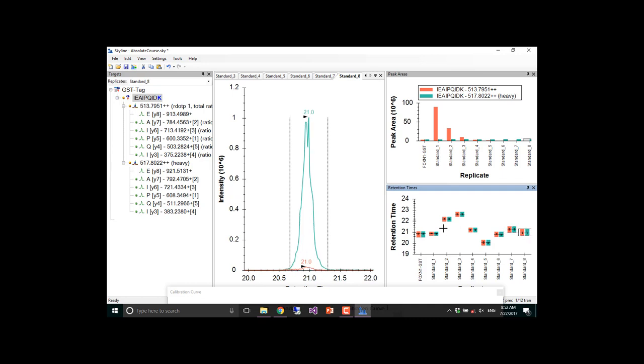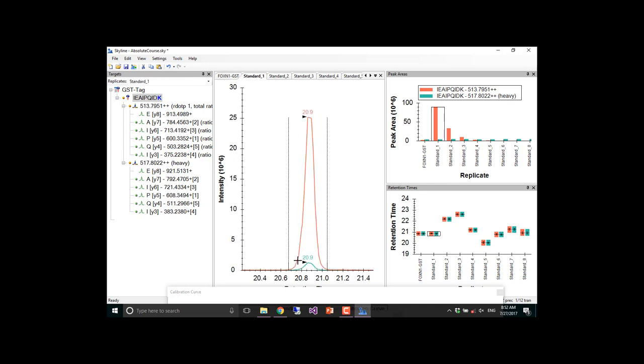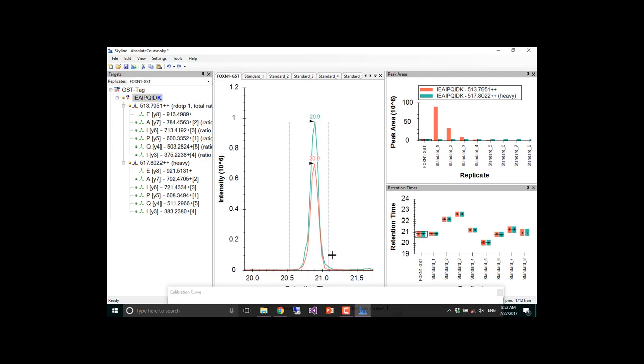I guess this one is maybe a little bit off. I could see somebody who really wanted to get things perfect wanting to do that. That's the kind of thing this person did. Like tailing peaks, he moved them out a little bit to get the full tailing, and in the end they decided that was not useful for them.